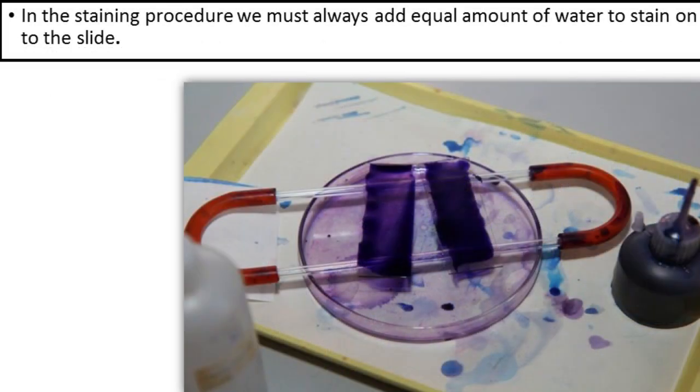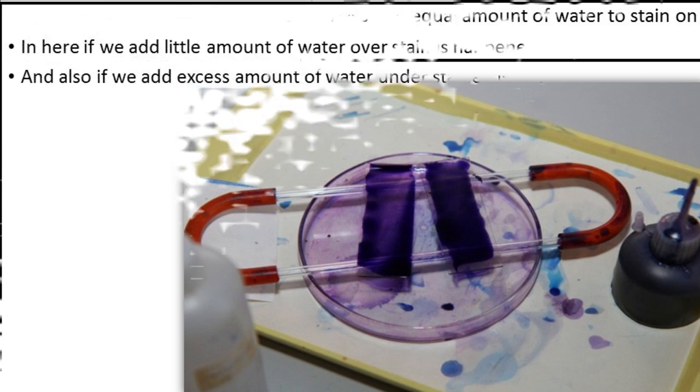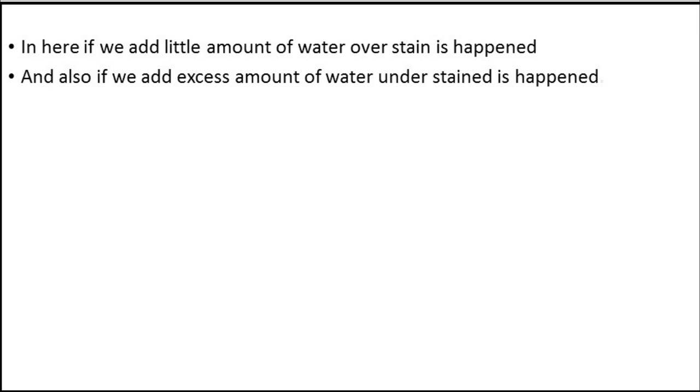In the staining procedure, we must always add equal amount of water to stain onto the slide. If we add little amount of water, over-staining happens. And if we add excess amount of water, under-staining happens.